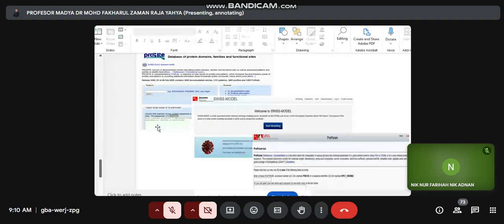for the result. If we want to carry out 3D prediction of protein, we can use Swiss model software. I know the current one is called, yeah. Any idea about, I think, the most popular tool that we can use to predict protein structure? Any idea about this?